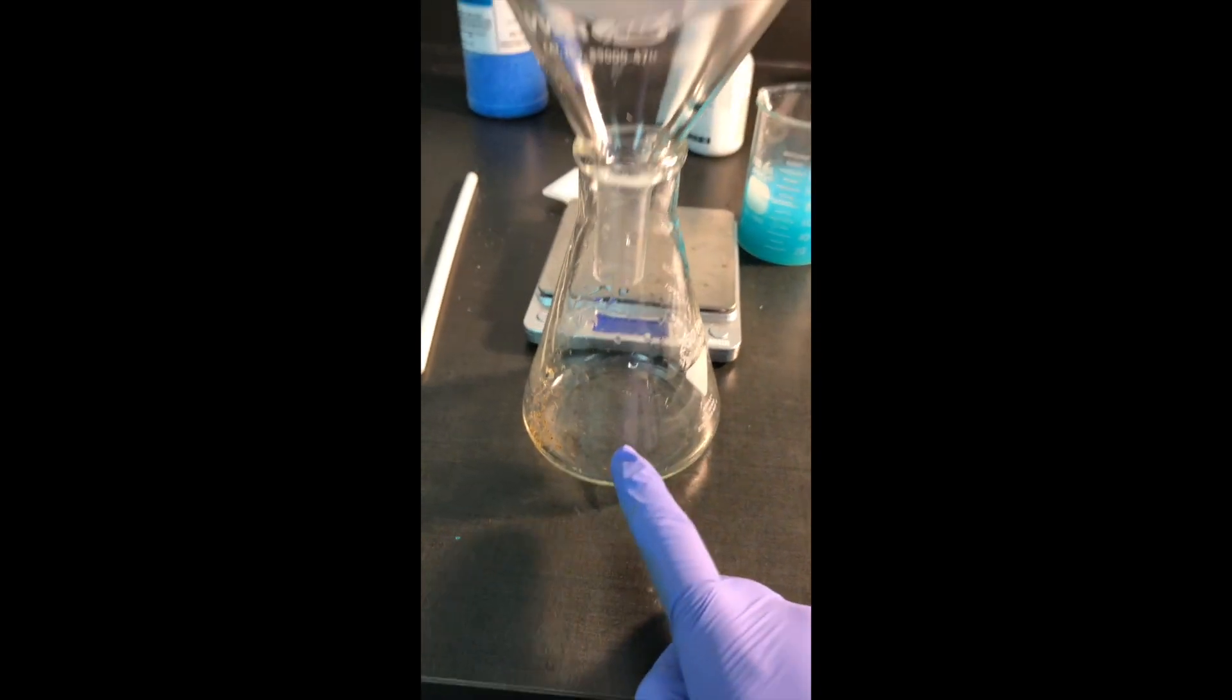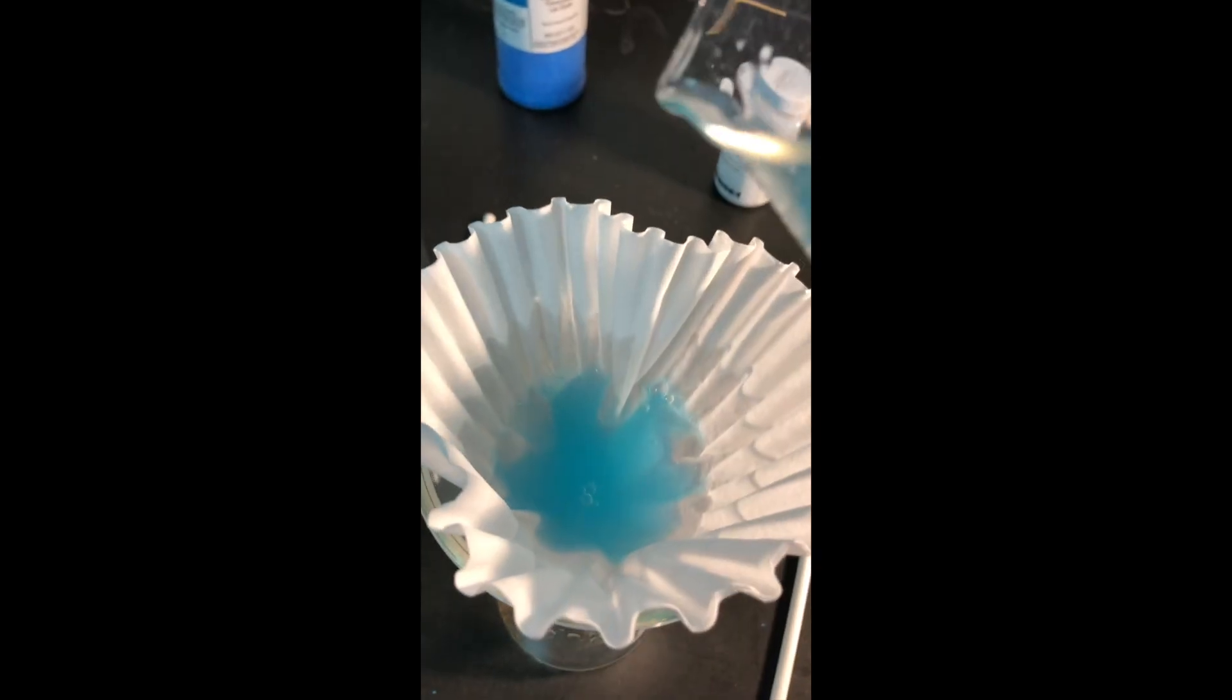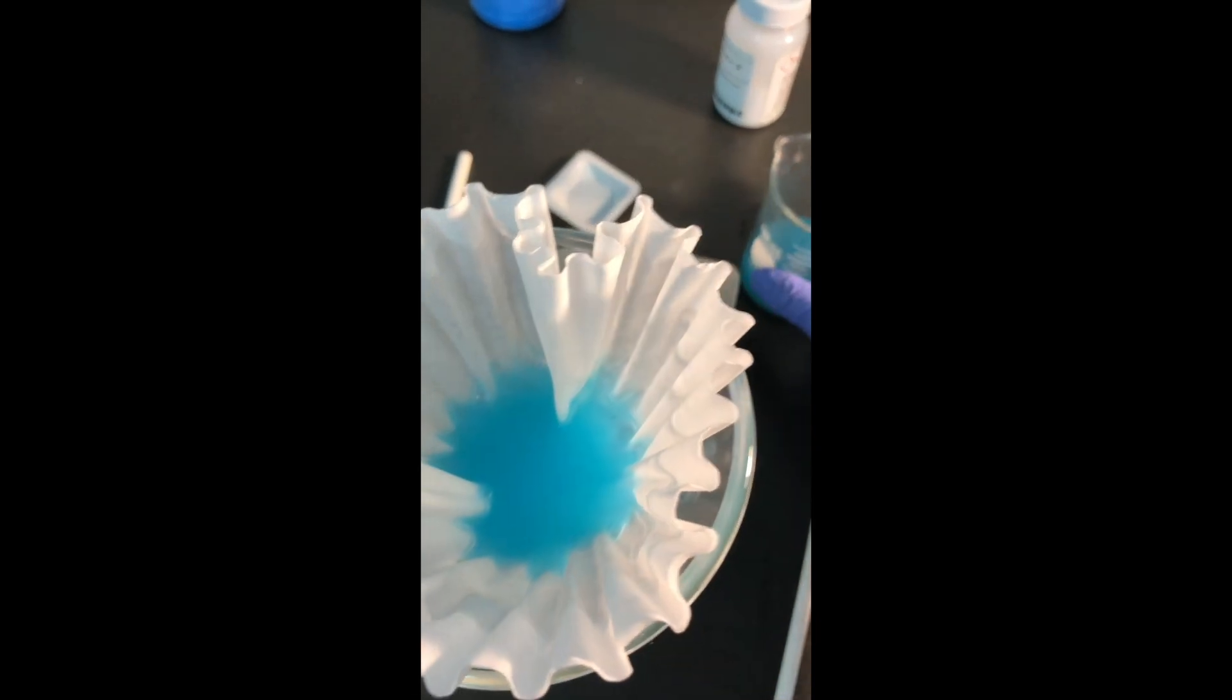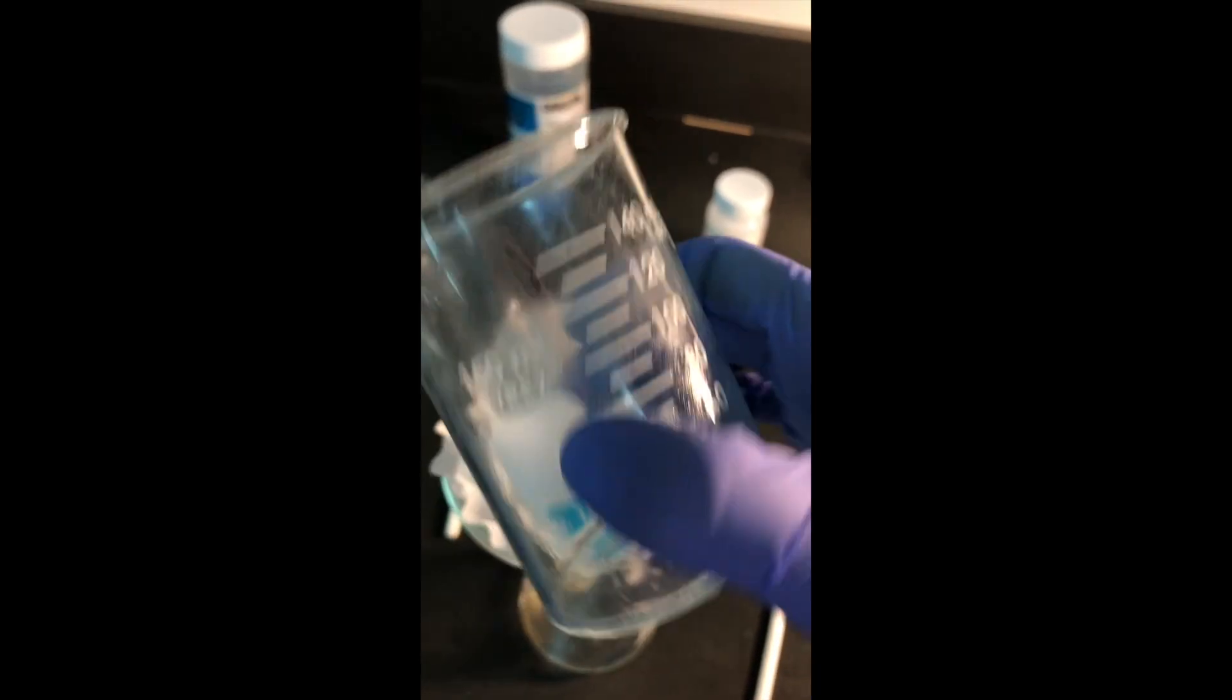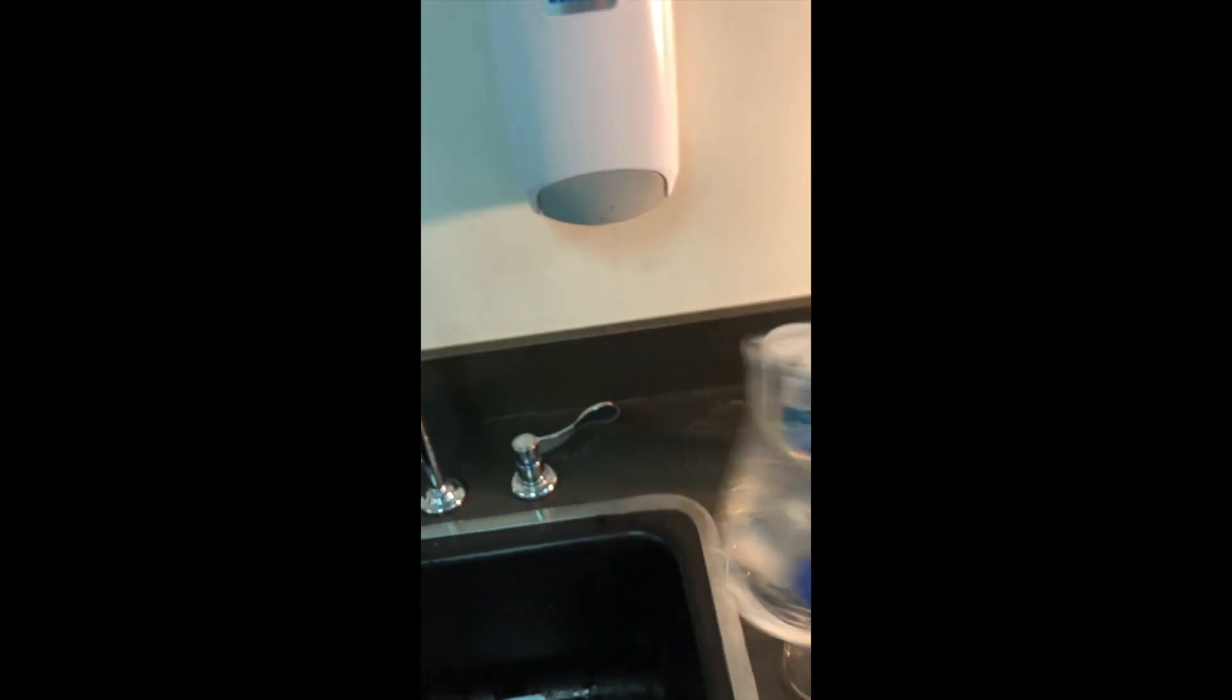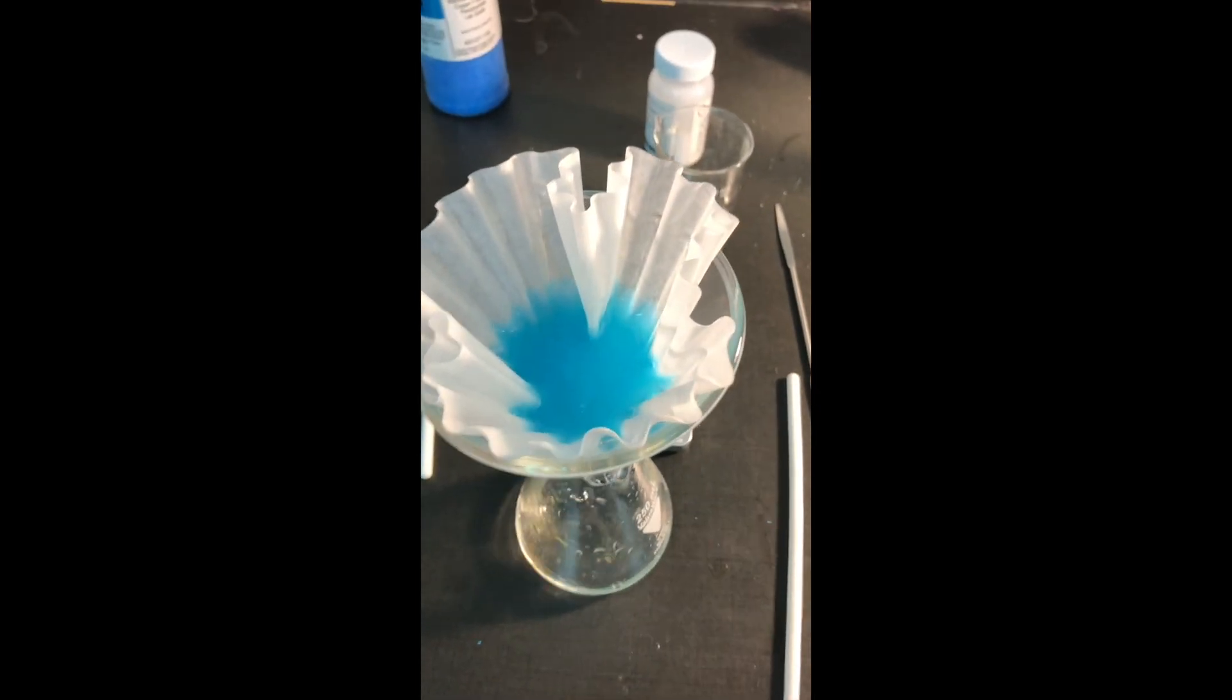So once we have our Erlenmeyer flask with the funnel and the coffee filters, you can pour your solution into the coffee filter slowly. If you pour too fast, you might spill some solution. And that would pretty much be a failure of your experiment because we're trying to collect all of this beautiful blue solid. I'm just slowly pouring it in here. We don't want to overflow. If you see there's still a lot of blue in your beaker, you can do the same thing I did before, which is add a little bit of water. Don't pour this down the sink. This is your precious product. So this is happily dripping out all the liquid. We want to get rid of all of that liquid. So I'm going to pour the rest of this water in here from rinsing out my beaker.